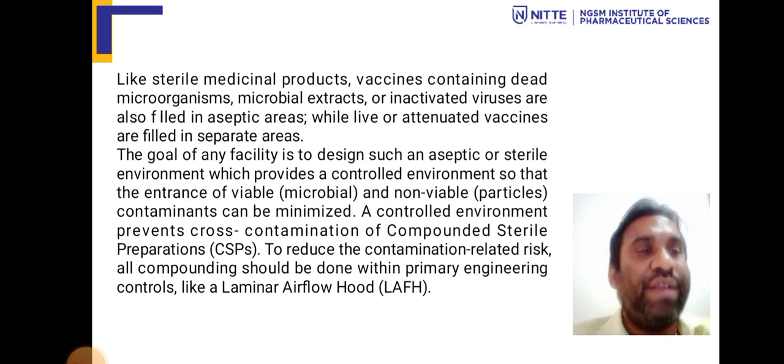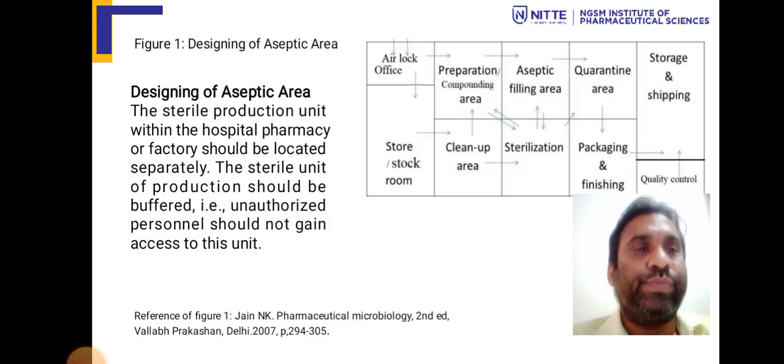The goal of any facility is to design such an aseptic area or sterile environment which provides a controlled environment so that the entry of viable microbial and non-viable particle contamination can be minimized. A controlled environment prevents cross contamination of compounded sterile preparations. To reduce contamination-related risk, all compounding should be done with primary engineering controls like a laminar airflow hood.